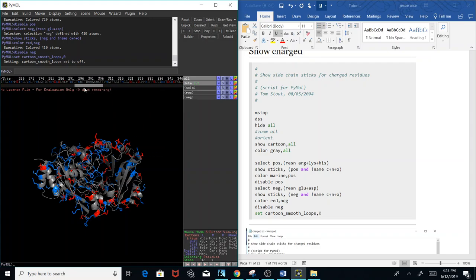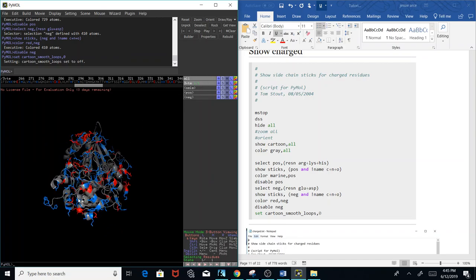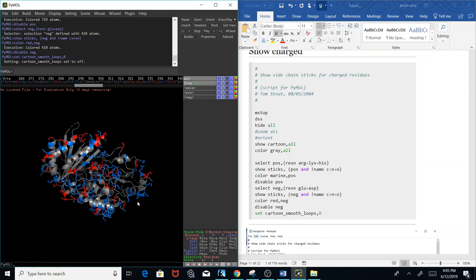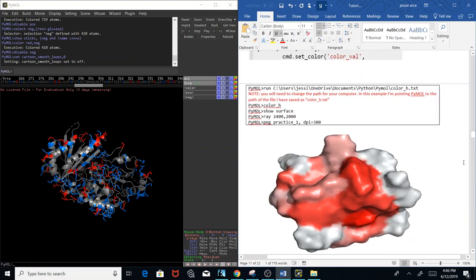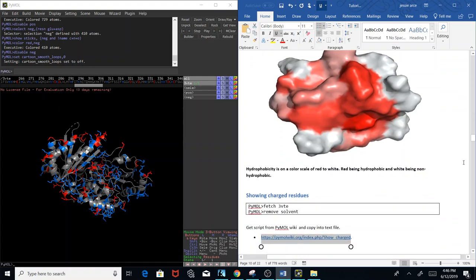That's another script — you can do this on other proteins as well. In your homework you might be asked to highlight hydrophobic residues; use the color_h plugin. If asked to show the surface with hydrophobic residues colored, use the color_h plugin, then 'show surface' and create a picture. If asked to show charged residues, use the charged residues script. That would be the answer.